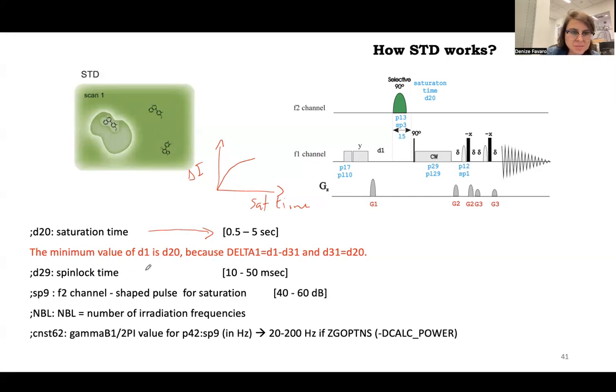The d29 is the spin lock time. Usually it's from 10 to 50 milliseconds. So you leave the saturation to spread. This is the shape pulse for saturation. So this is the power related to this pulse. We use the standard 50 millisecond duration.